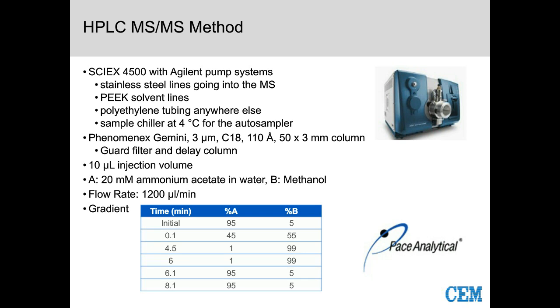If you note, this gradient is just over 8 minutes long. So the extraction time was less than 10 minutes, and the analysis time was less than 10 minutes. So total process, you've got data in hand in under 20 minutes. That's really great for an R&D environment.